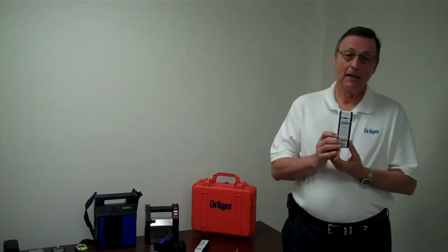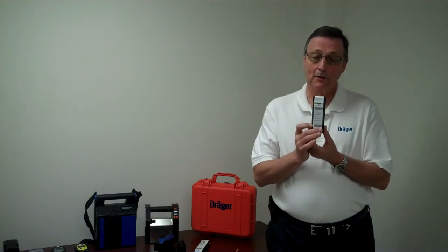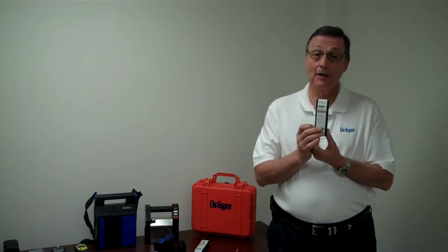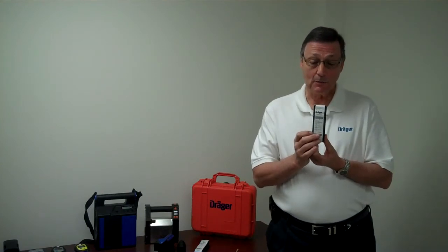Breaker tubes are packaged in a black plastic box to protect the glass tubes from breakage and also to prevent ultraviolet radiation from deteriorating the chemical reagent in the detector tubes.